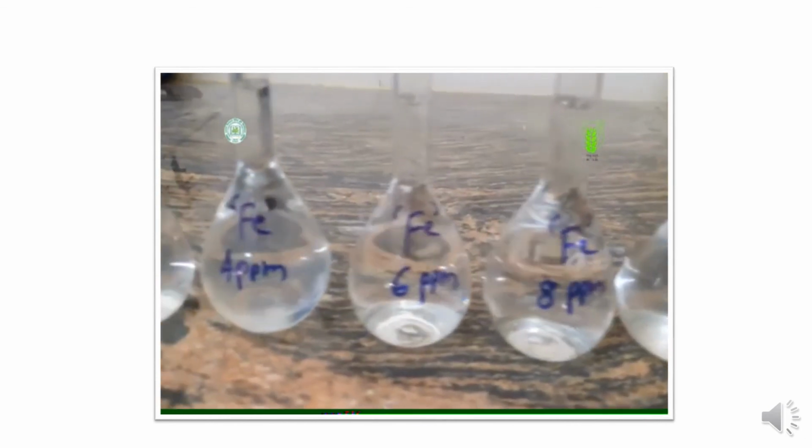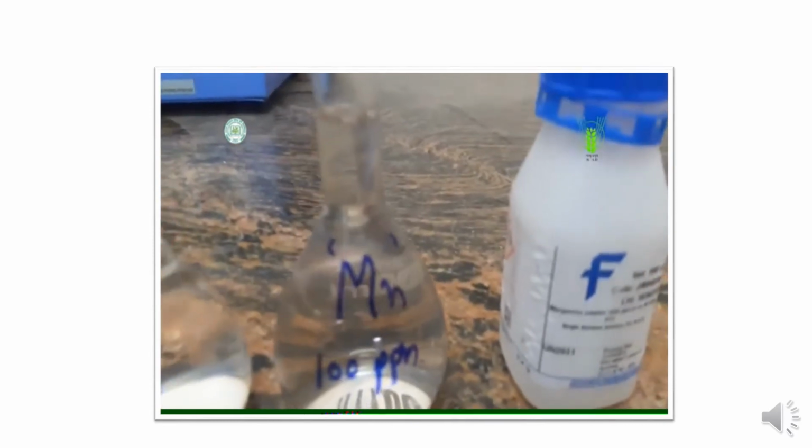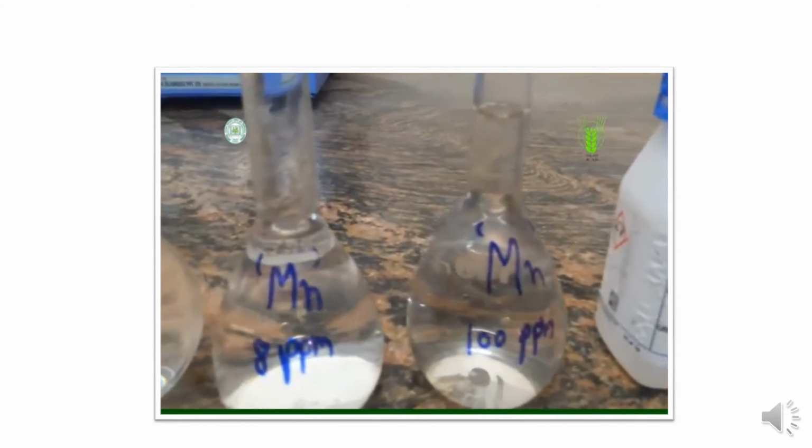To prepare the standards, we can find the commercially available stock solution. 1000 ppm stock solution can be purchased from the market, or you can prepare it by yourself.